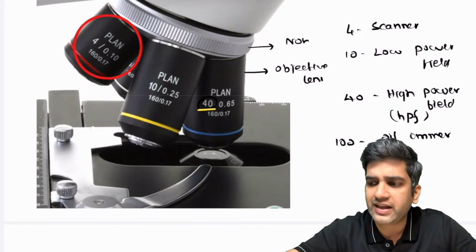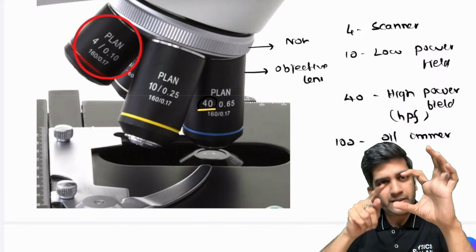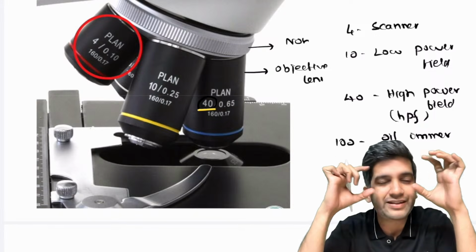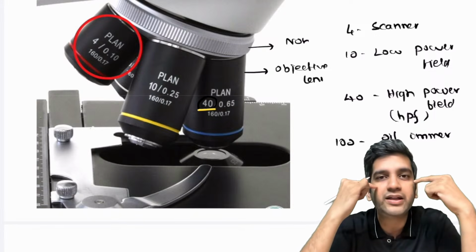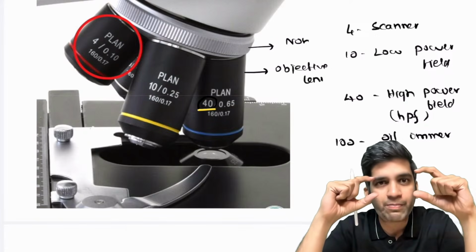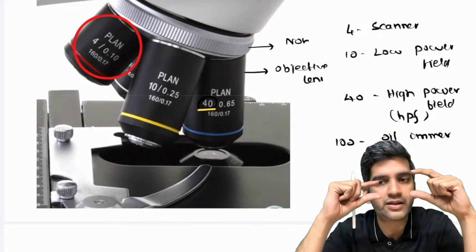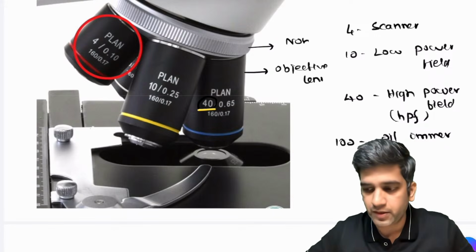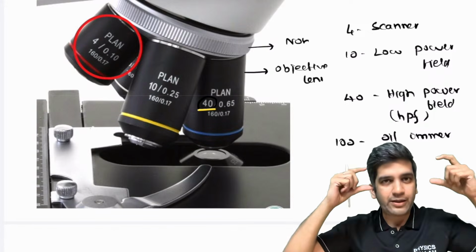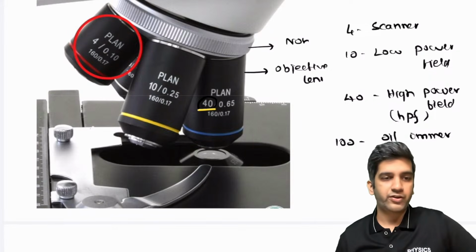Okay, I don't think so. The diameter of the eyepiece matters. Even though I have a bigger eyepiece, the lens will be the same. See, you might have these big spectacles, but my field of vision is going to be predominantly here, right? So the center part, which I'm going to focus, will be smaller. Doesn't matter whether you're a bigger eye or a smaller eyeball, fine? Okay. That's how it will be. If you want, there are a few adjustments for you to keep it, but that's not required. You'll get used to it if you work on it for some time, fine?